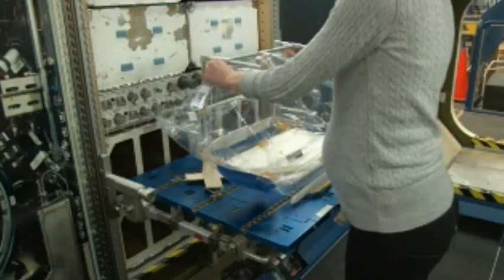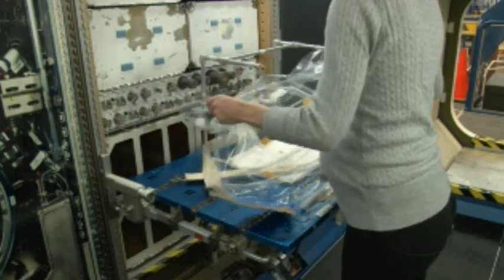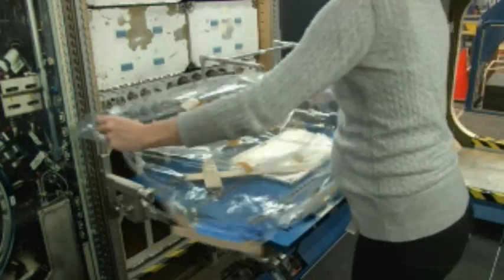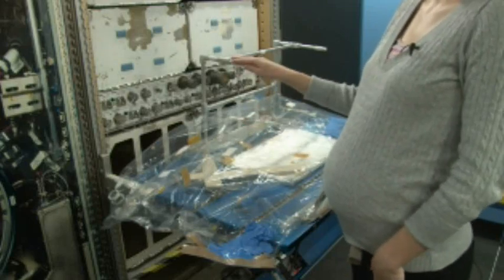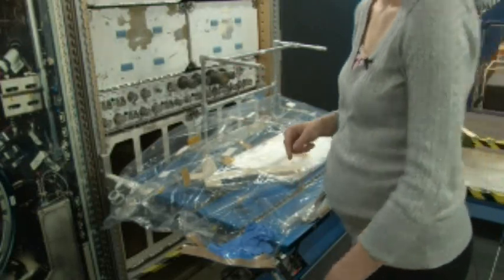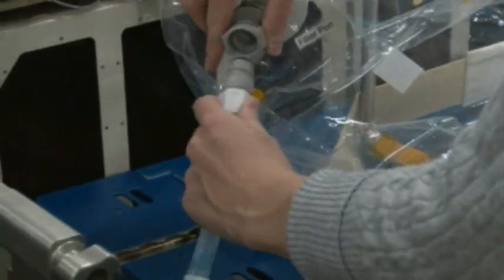First step in the spill cleanup — the off-nominal situation — remove the glove bag from the glove bag frame by just detaching all the Velcro pieces. Once the glove bag is removed from the glove bag frame, the glove bag filter is retrieved. That is used only for an off-nominal situation such as a spill.